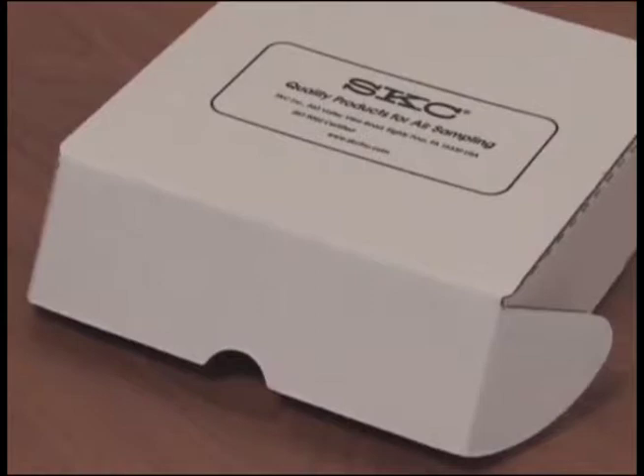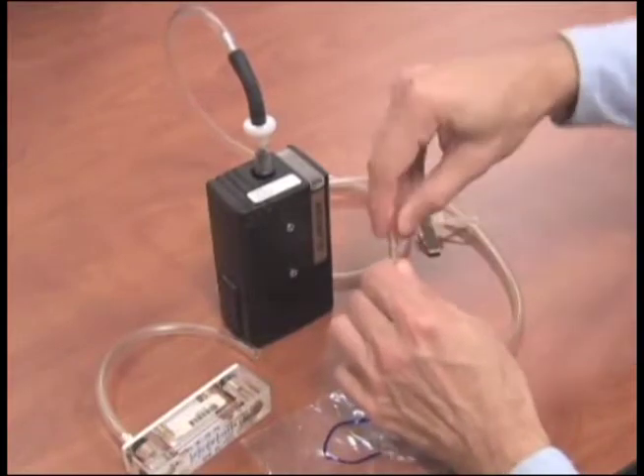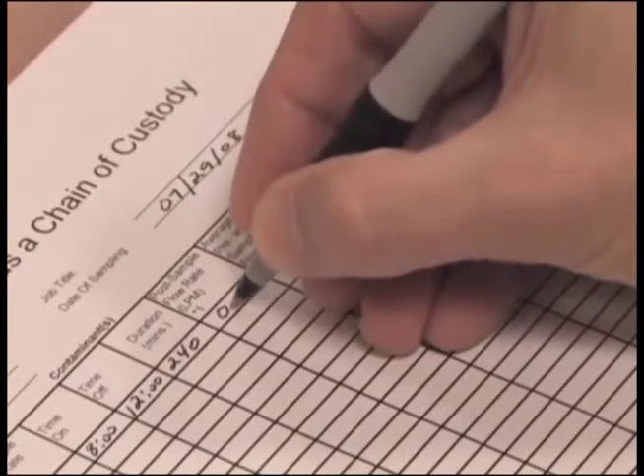Perform a post-calibration in the same manner you used to perform the pre-calibration, then record the flow rate on the pump calibration sheet.